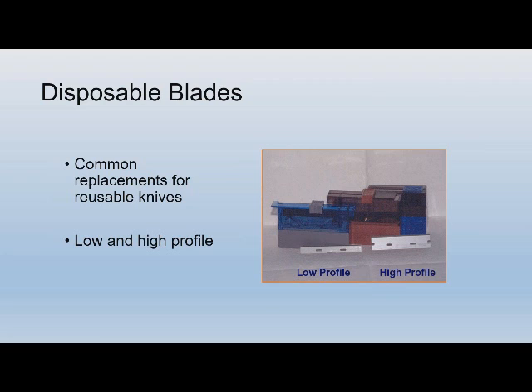But I'm going to have to kind of disagree with that. If everybody used the same disposable blade, that statement might be true. But since there are many types of disposable blades on the market, one clearance angle may not work for all brands, so you really do still need to have that. But that's what the clearance angle setting is all about.